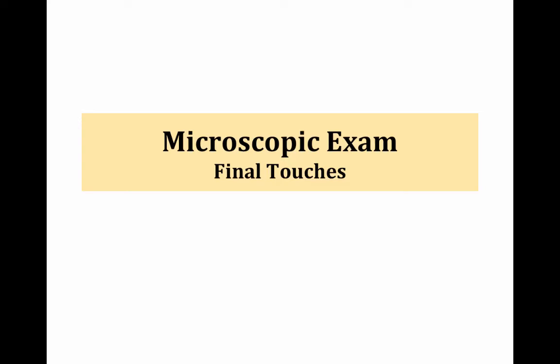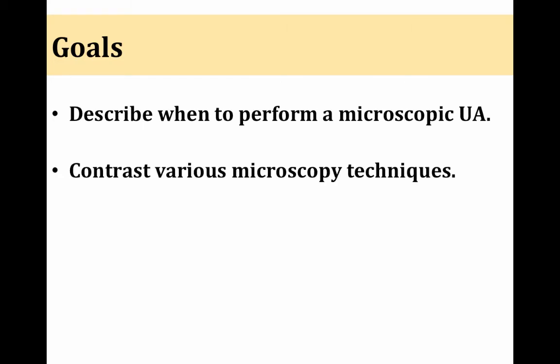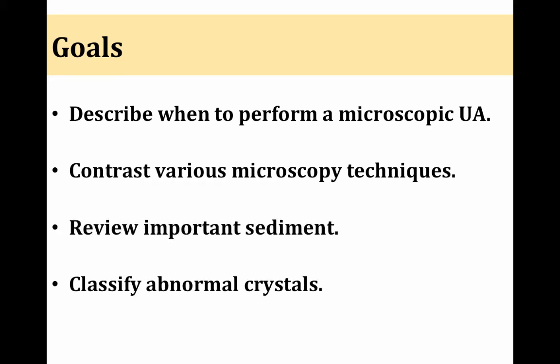The video today is regarding microscopic urinalysis examination, and we're just going to go over some of the final touches to summarize all the important aspects of microscopic urinalysis. The goals of this video today are to describe when we should be performing a microscopic urinalysis, contrast various microscopy techniques, review important sediment, classify abnormal crystals, and discuss urinary disorders.